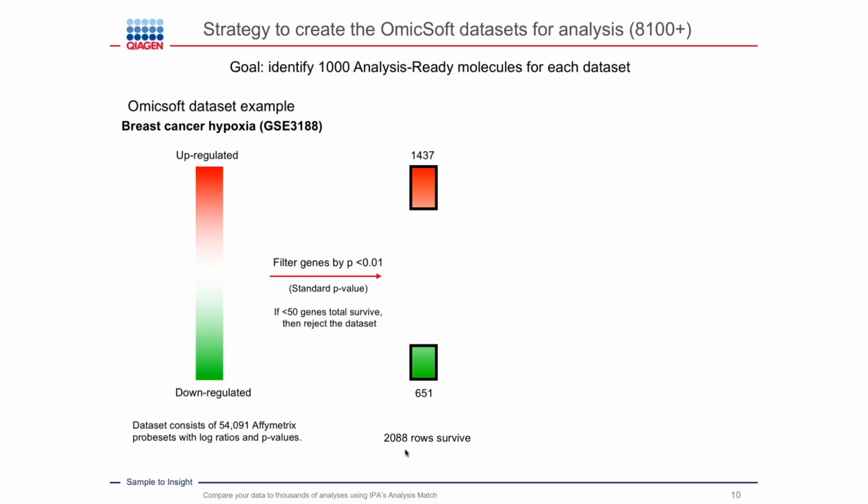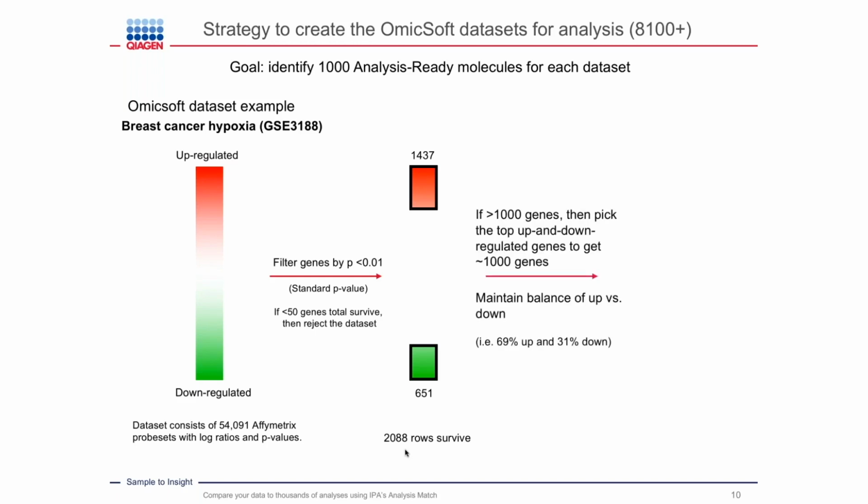1,000 number. So rather than setting just a standard fold change or other expression measurement cutoff, we decided to look at each data set individually and determine the proportion of up or down regulated genes. So in this example, we have a lot more upregulated genes than downregulated genes in this data set. So we can then set some cutoffs to reflect these proportions. And when we're doing this, we end up with about 711 upregulated genes, which range from a fold change expression value of about 0.5 to 2.6, and 291 downregulated genes. So here we have a little bit different cutoffs just to reflect that proportion, that balance.